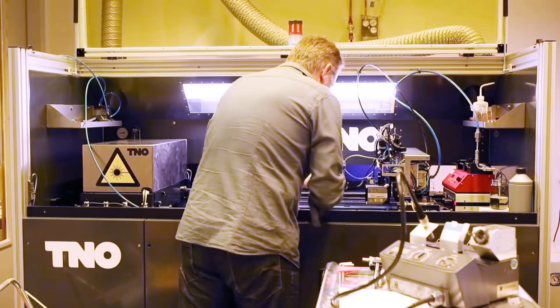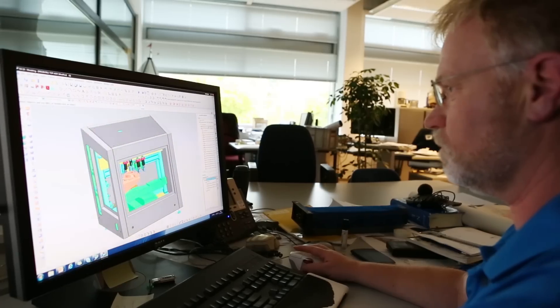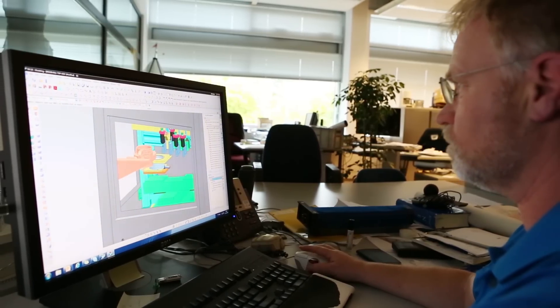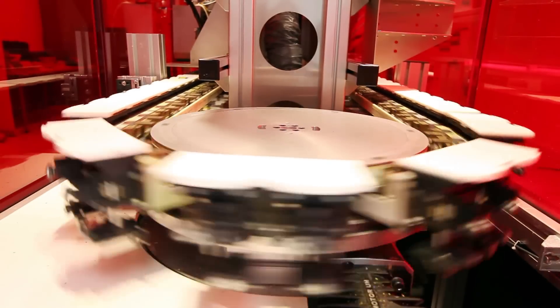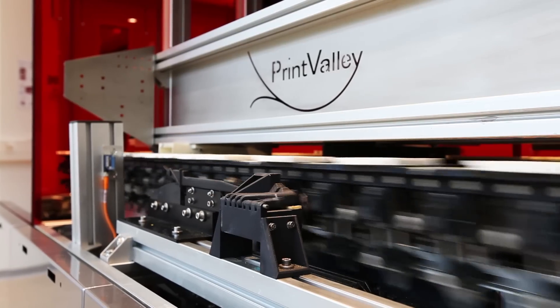But TNO isn't just printing tablets. We also develop the printers. Machines like our Print Valley printer can produce both small and large batches of tablets and can be customized specifically for your needs.